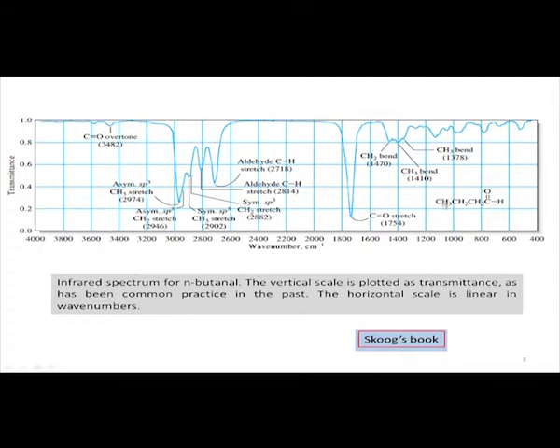not of the CH3 or CH2 or any other CH2, but it is characteristic for the corresponding aldehyde function. So, you have a 2814 for the aldehydic CH, and the other one is also the corresponding stretch of the aldehyde CH.